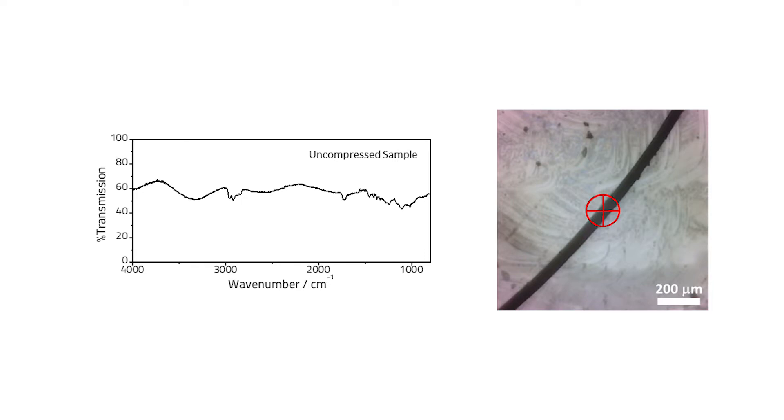Well, to demonstrate the benefits, we will first show an uncompressed sample. As you can see, poor signal is observed through the uncompressed sample.